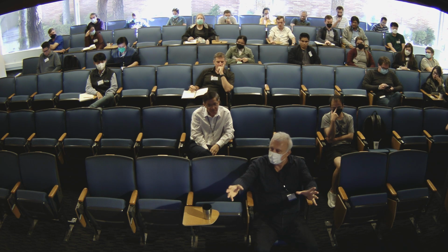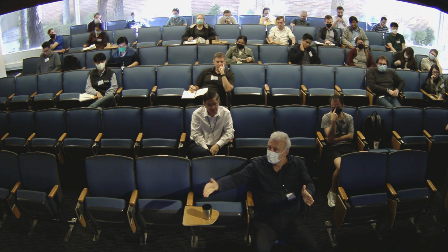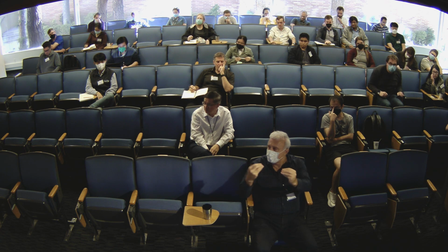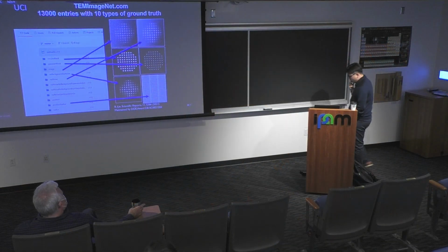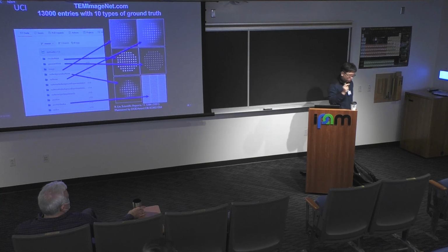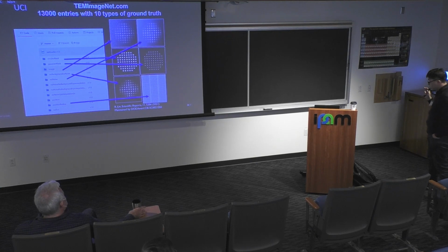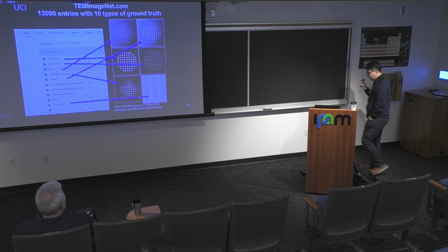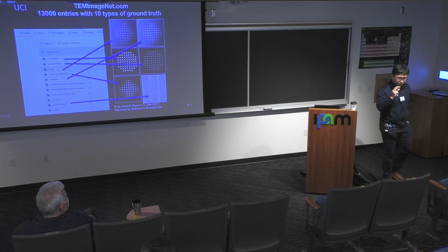You say, okay, I need a network that creates something. So let's back out a little bit, right? We are just talking about the weaker framework of artificial intelligence here. So our autonomous TEM at this stage, in the next 10 to 15 years, that we want to realize is a weaker form of a human operator, okay?